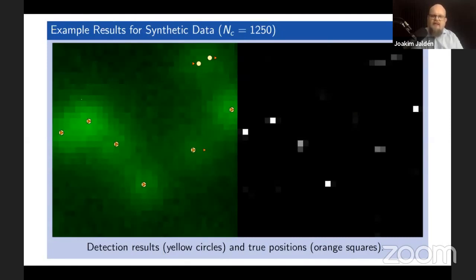And then you can really see that the group sparsity does a very good job of isolating the sources to very localized positions. So there is one error in this particular case, and it's these two spots here, which happen to be simply 1 pixel apart, or with 1 pixel in between them. That's a little bit too narrow for the algorithm, especially since this particular spot is weak as well. But here you also have 2 spots which are nearly 1 pixel apart, which the algorithm successfully breaks. So it is quite good at actually breaking these clusters, which I showed you in the beginning.